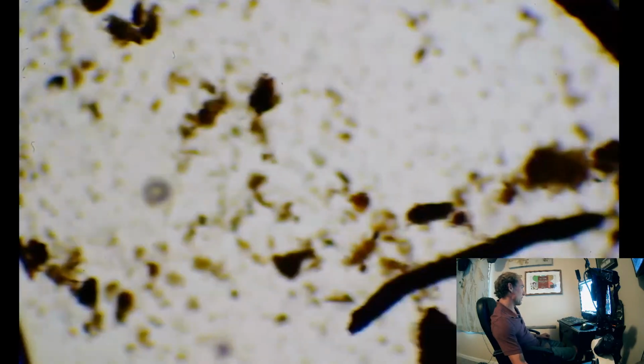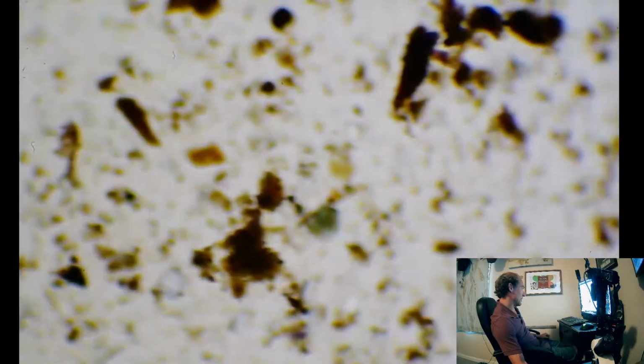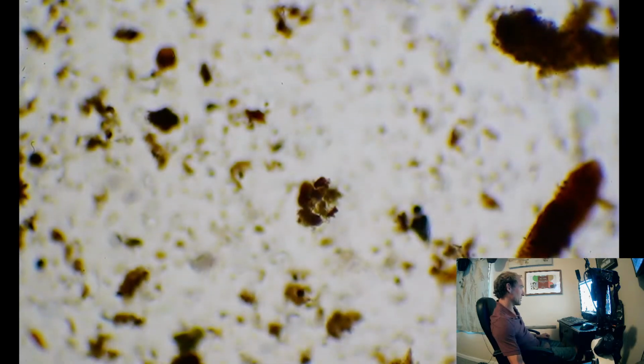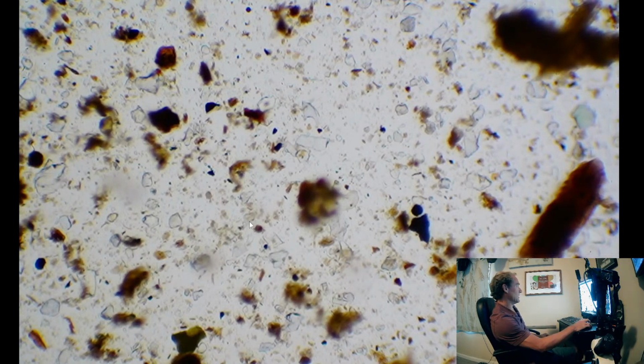Man, probably should go into 400x to inspect what's going on here a little bit closer. But we're going to continue zooming around. So, this is looking a lot like clay. When I did the sample, we had a real good amount of nice looking soil on top with organic matter. Hence, I've remediated this bed. It's a fairly new bed that I made.